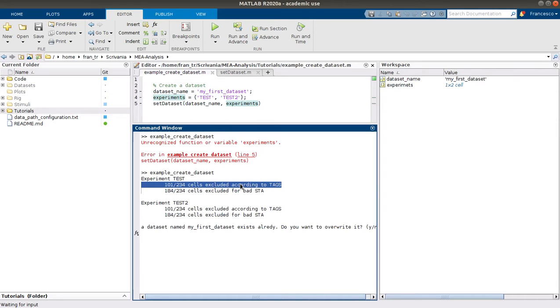So as you know, you can grade cells in the post-processing of the spike sorting, and you can assign grades to the cells from A to E, usually A being the best and E being the worst. So only the cells with good grades are kept and put in the dataset. Similarly, when you run the STA defactorization function, for some cells you will not find a good defactorization, so those cells are not included also.